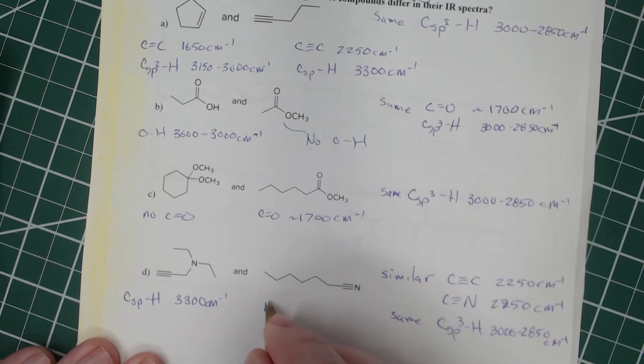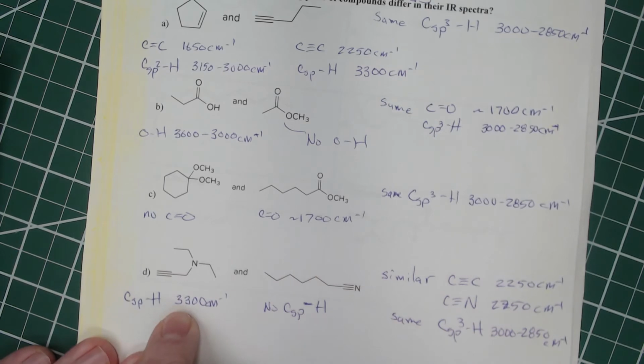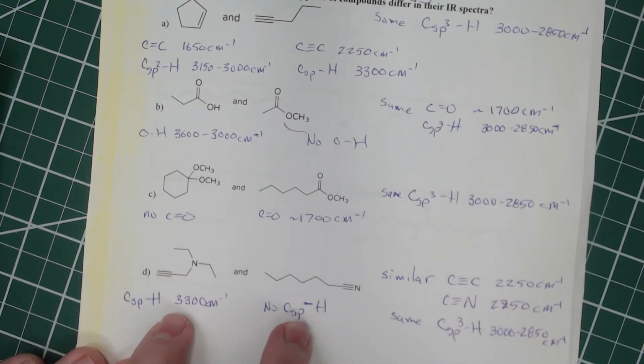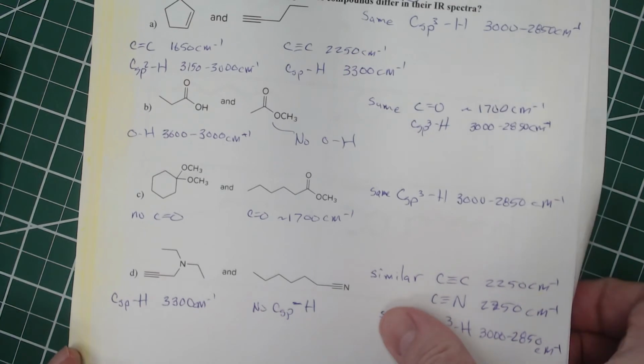So this one has no carbon sp hydrogen stretching. So you'll see this one at 3300 because it has that terminal alkyne, and then this one we won't get that peak. So there's a lot that's going to be similar, and this will be the main difference between those two, as one will have that and the other one won't.